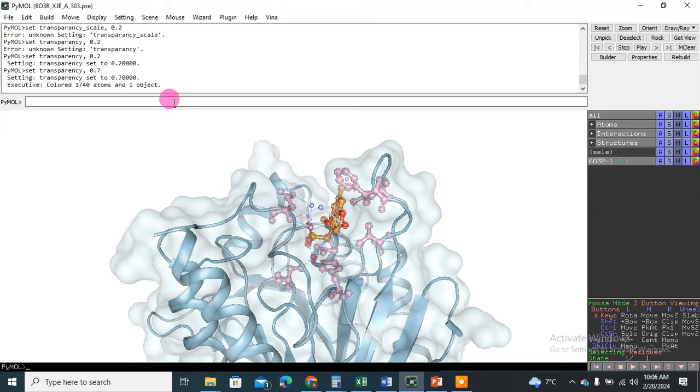Okay, now ray, I'm using 2000-2000. Once again I'm going to tell you, this is for the length of the figure and this is for the height of the figure. Okay, I have entered it.